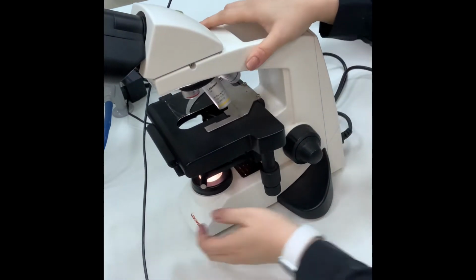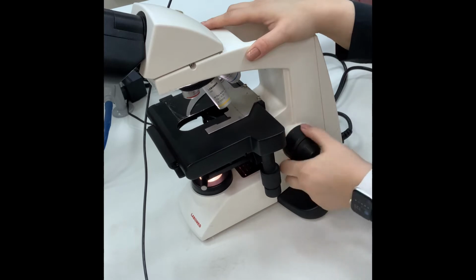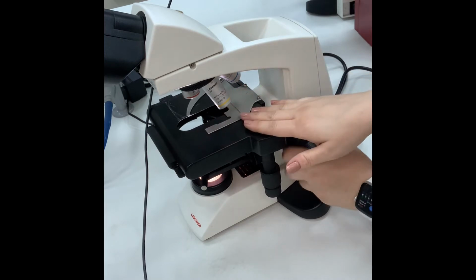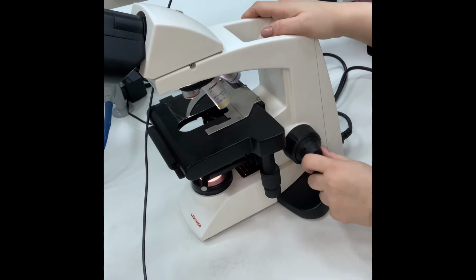I have here 2 knobs, the big one and the small one. This is the big knob. Look at the big knob, it controls also the stage. It takes it upwards and downwards. And this is the sharp or fine focusing, so coarse, fine focusing knob.